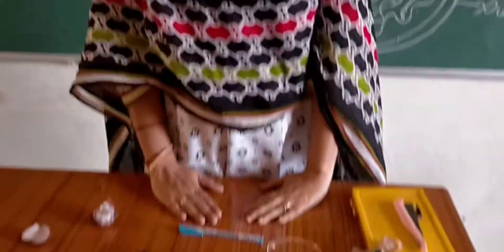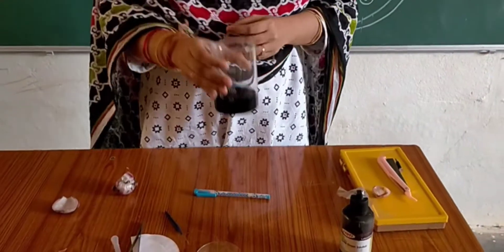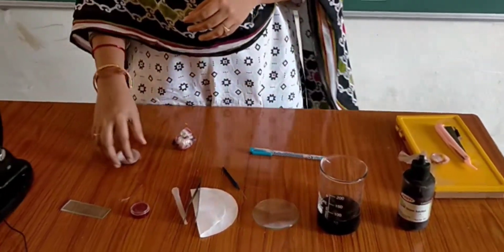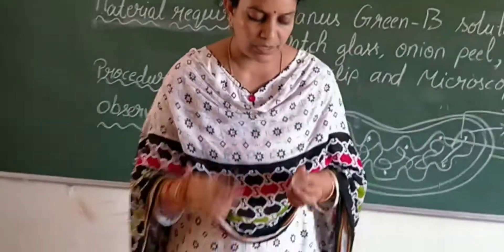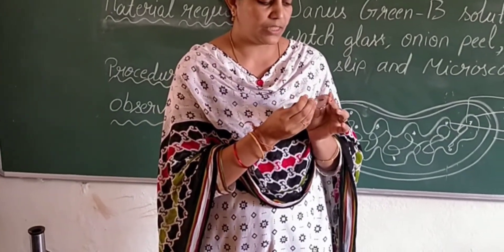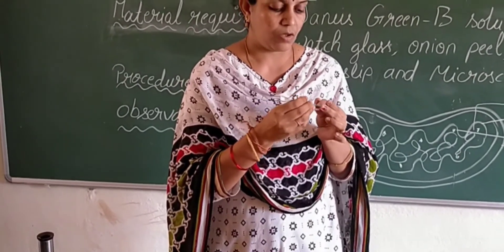First of all, in this activity, we should prepare Janus Green B solution. Next, take an onion and we should take a small, thin layer from the onion.